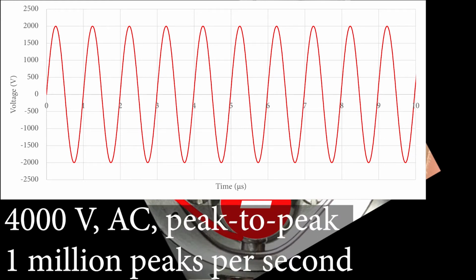There's another characteristic to this voltage signal that we need to characterize, and that is how often it oscillates up and down. How many times does it go up and down per second is usually what we say, because there's AC voltage, a very common AC voltage would be 60 waves per second. That means it goes up and down and back up again 60 times per second.